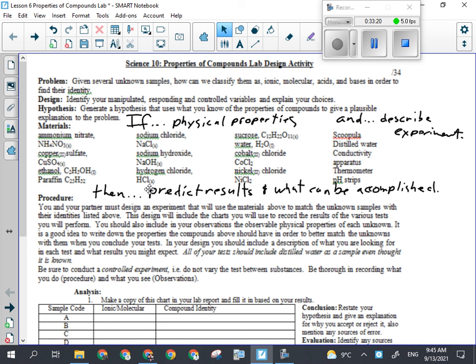So I just take that pH strip and dip it in the solution. This is going to be pretty neutral because it's just salt water. And then I just compare it color-wise. Yeah, it's probably about a 6, closer to 6. That's it. So dip it in the solution, quickly compare it to the color chart, and record the pH.